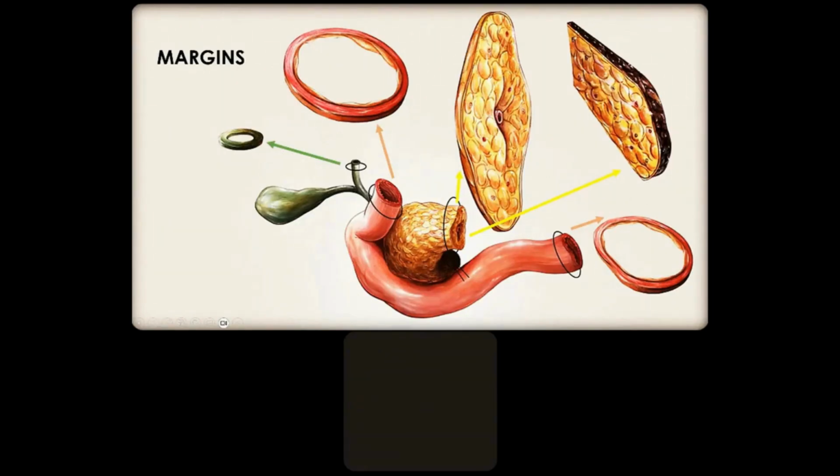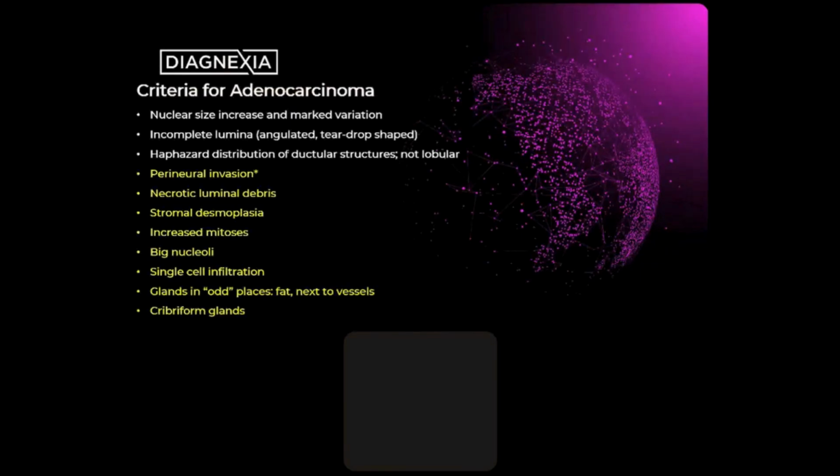So always ink and use your uniform ink colors, so you know where the posterior aspect is, you know where the vascular groove is, and that's why I emphasized where the vessels grow. And that is a very critical margin, the posterior margin or retroperitoneal margin. And remember, the anterior bit of the slice that you take is a surface, it's not a margin. This is the posterior aspect of it. So be aware of what you're looking at.